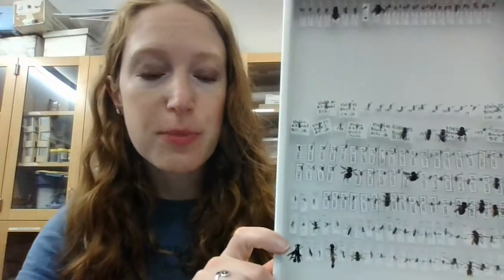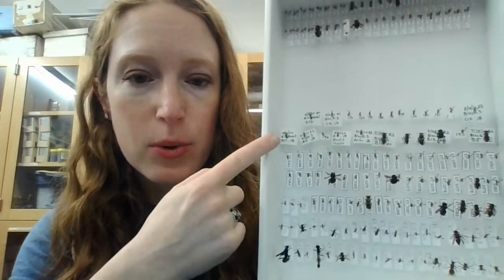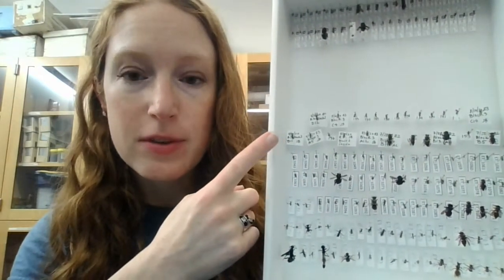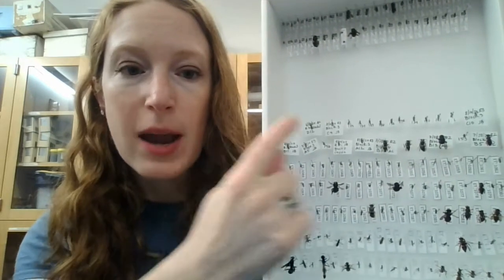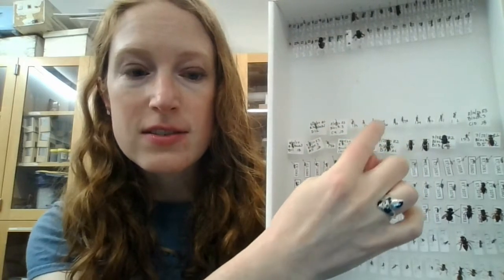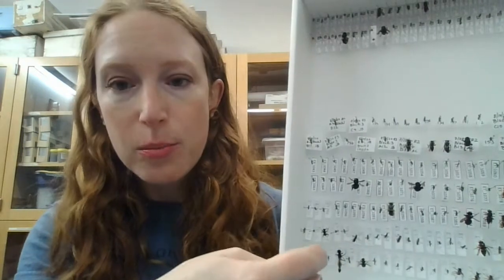And in the first stage of pinning, we're just giving them sort of these messy labels. They have quick notes that were from in the field about where and when each bee specimen was collected. Bees that were collected in the same trap will just be in a row next to the same label. Each bee gets its own unique number as we're quickly going through and pinning these bees.